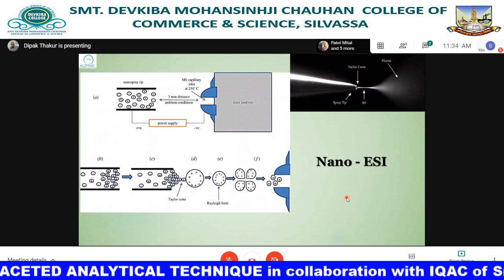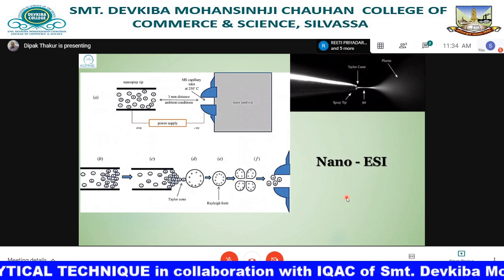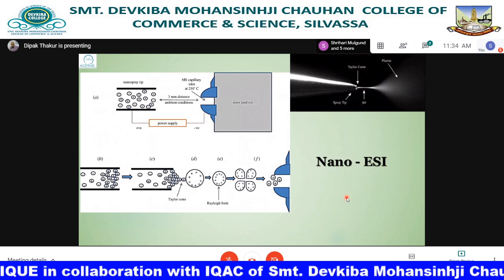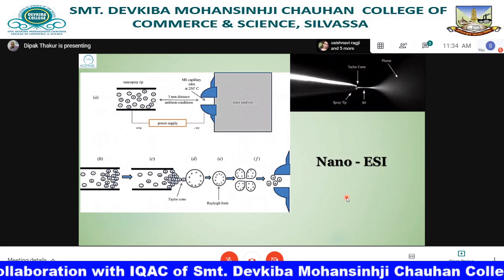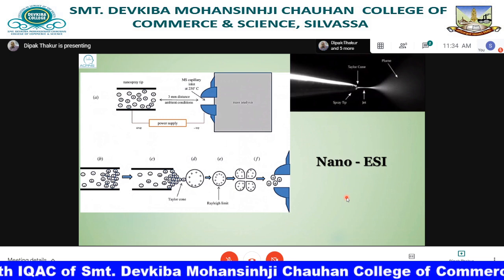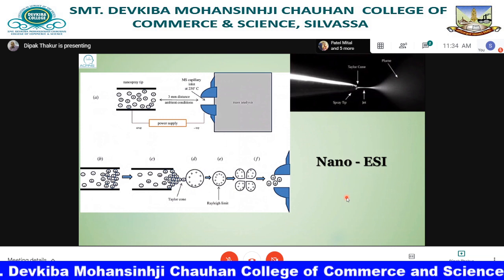Mass spectrometry measures molecules in terms of their mass to charge ratio. If there is no charge, neutral masses cannot be measured. So one of the requirements is to generate ions. Molecules, whether in ionic or neutral state in the liquid phase, need to be converted into gaseous ions so that mass spectrometry can measure them.